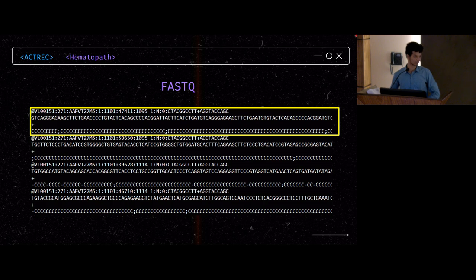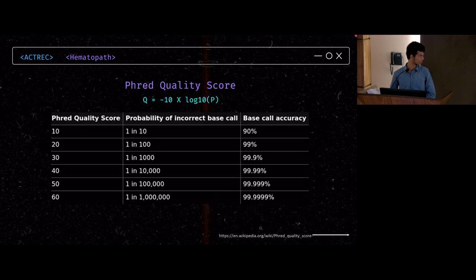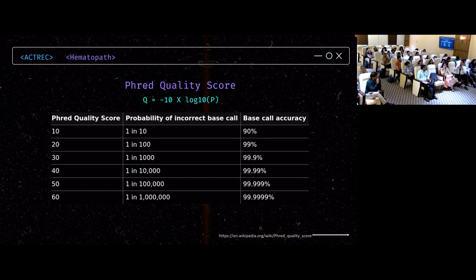What is the acceptable one, at what level? So the quality depends on quality metrics. When you get the sequencing run, you will have a Q score more than 90%. That is like a median score of 90% for Q30, right? That's what you are looking for. So Q30 more than 98% or something is very good.